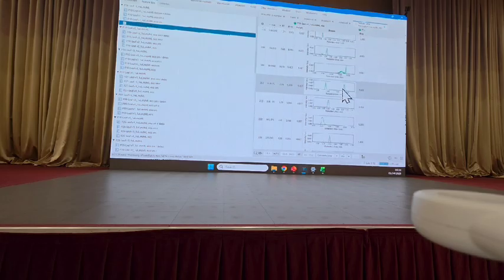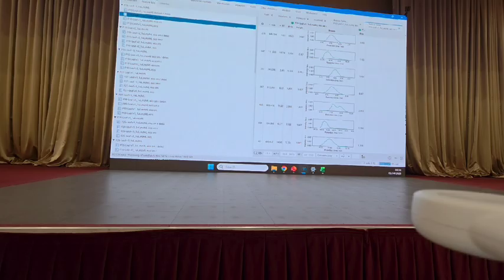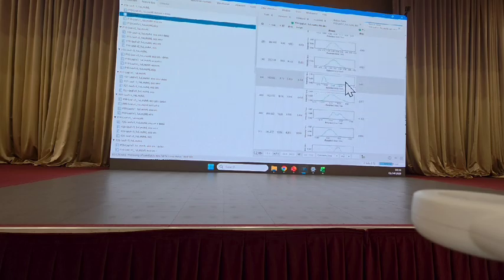So let's say, for example, these are 2 isomers, but we don't want them as the same feature entry since they have 2 different retention times. So in the next step, we did the local minimum resolver. We took those signals that were once in the same chromatogram and made them their own entries because they have their own retention times. And basically, what we did was create our feature list. Each one of these is a metabolite in the sample: a feature, metabolite, small molecule. Again, these are all synonymous.